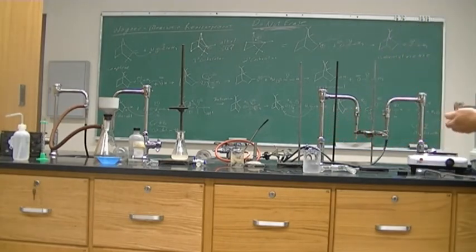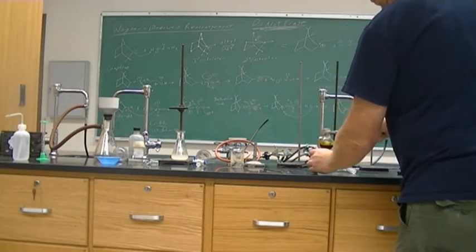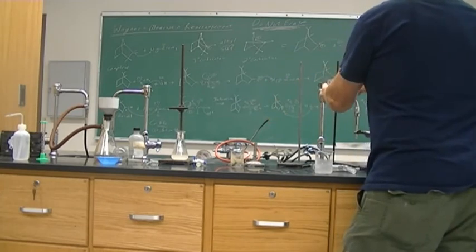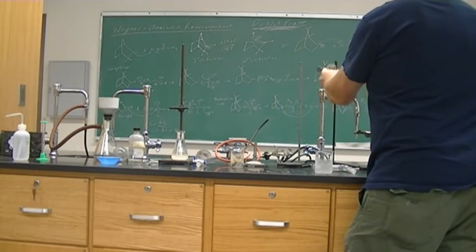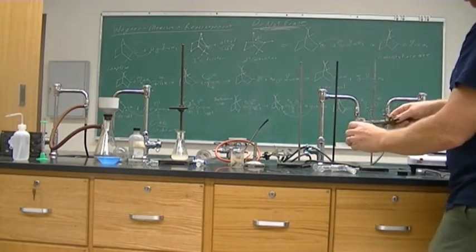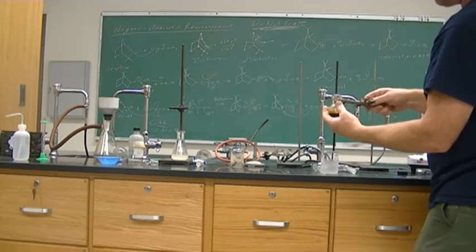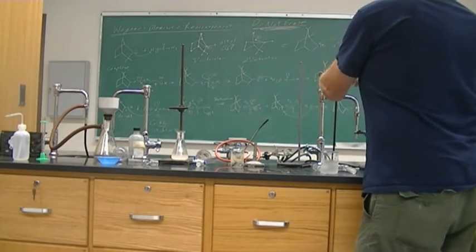All right, so now is where we're going to do our very short distillation. Definitely can tell the reaction occurred. It did warm up. It's still warming up. Cool it down a little more. We're going to boil it here in a minute. It's not really warm. You can tell the reaction is not boiling hot.